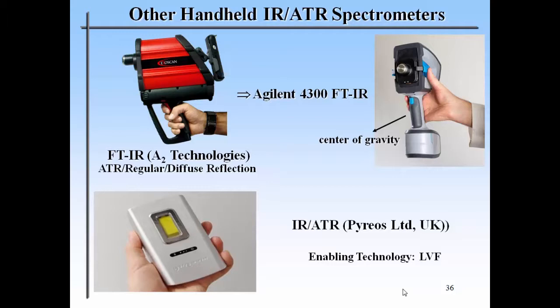It is also a little bit lighter. But it is now much easier to handle this instrument. So you can see not only instrumental details, sometimes also design details could be important in order to change the possibility to handle an instrument.